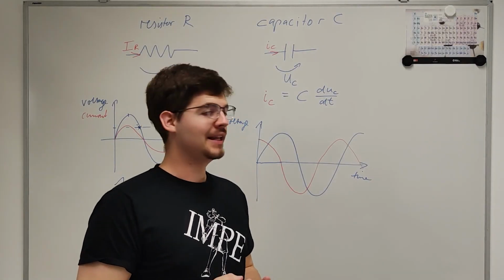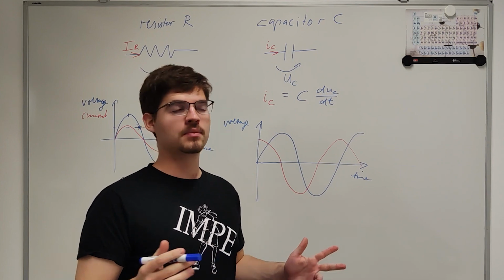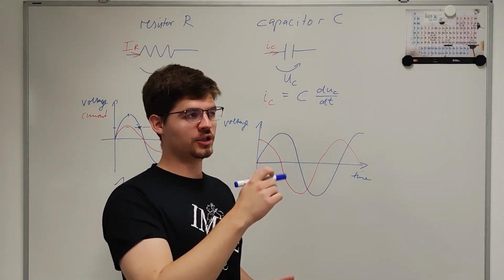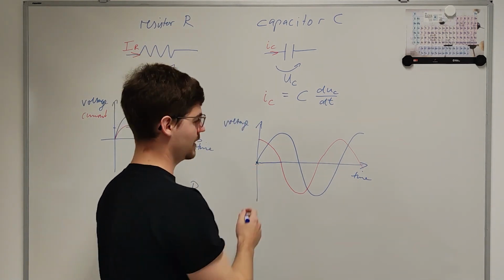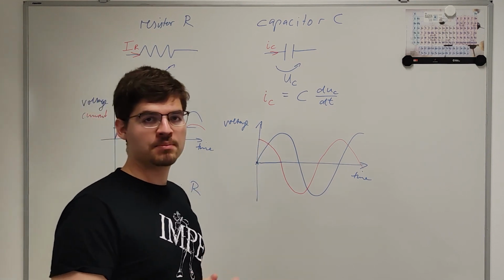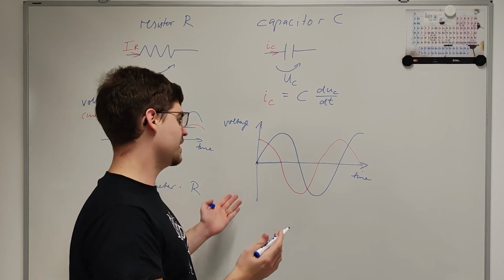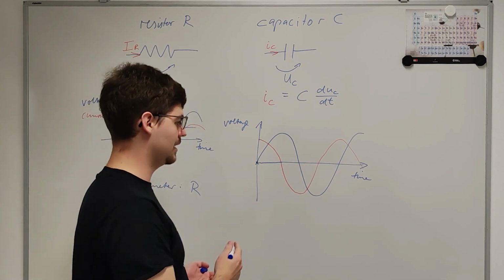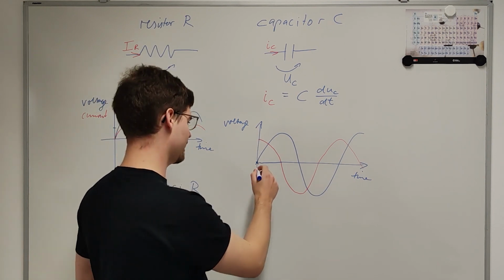So, let us consider now what happens if we try to describe a system once more with just one parameter, by, for example, dividing voltage by the current. Consider this point. At t equals 0, where the voltage is 0, we have some positive finite current. And dividing those two results in a parameter value of 0. Let us again continue calling this parameter R for now.